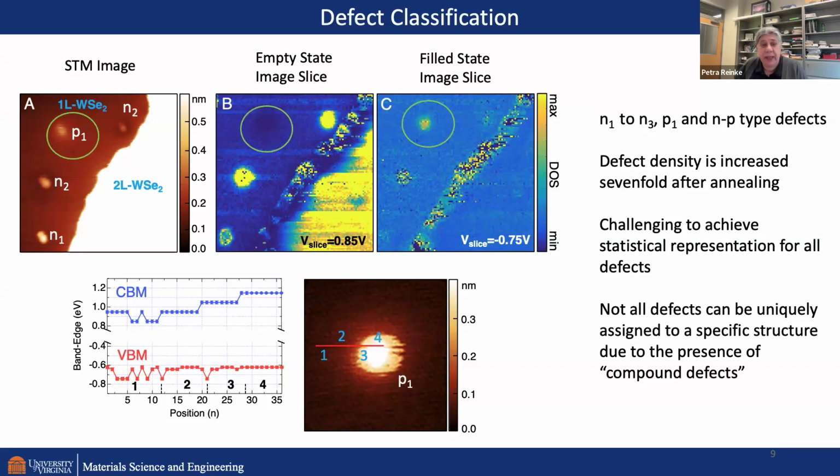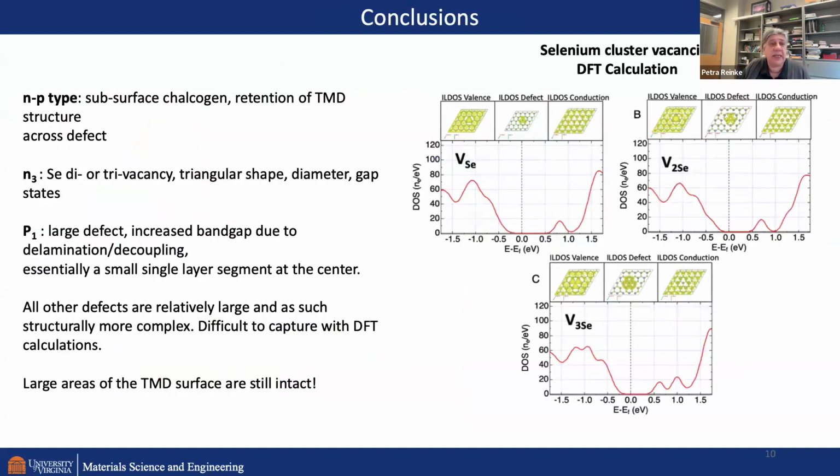And that's a very, very relevant question if you want to really study defects and how they influence your overall properties of the material. Ideally, our dream is to measure these defects within a device configuration, but very often due to transfer, you have residue on the surface and you're just not able to look at these defects anymore with STM, which I think is rather sad.